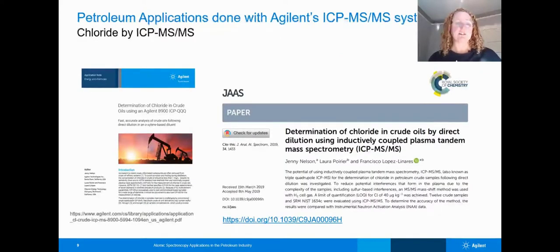Another example is looking at chlorine. This is an application note and a paper that we published recently where we looked at chlorine in crude oils by direct dilution. Most people know that chlorine suffers a lot of polyatomic interferences, and so using the triple quad really helped us to work at the chemistry and get rid of those polyatomic interferences.